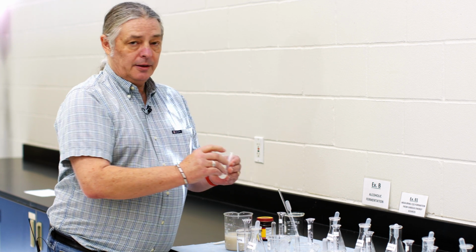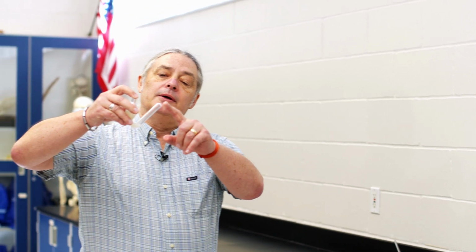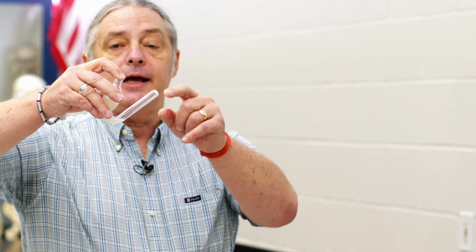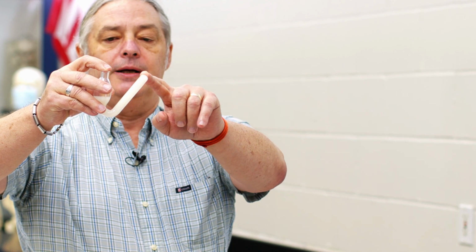Once you've added the proper amount of solution, we need to tip the little fermentation tube so that this end, that is a blind end to the tube, doesn't have any air left in it. So a little bit of manipulation like that, and you see it's all fluid.